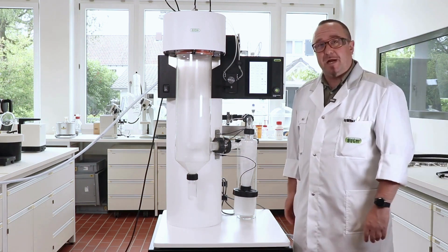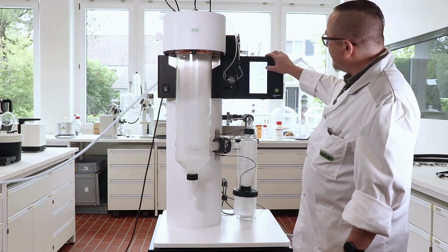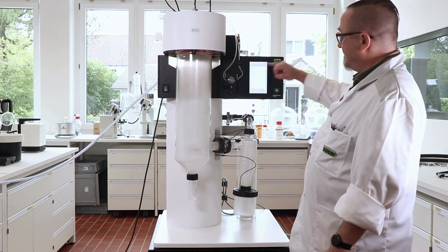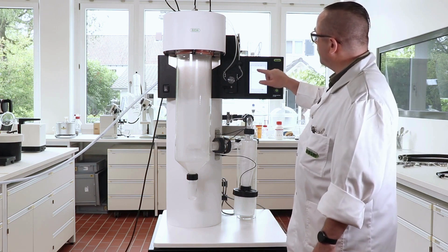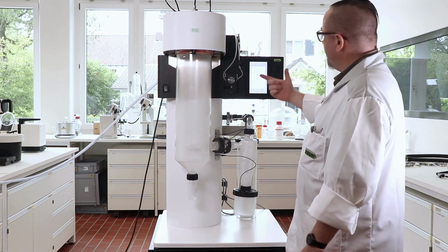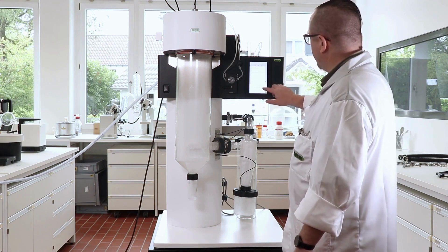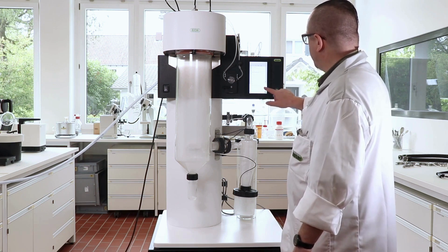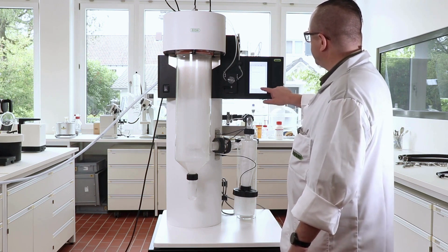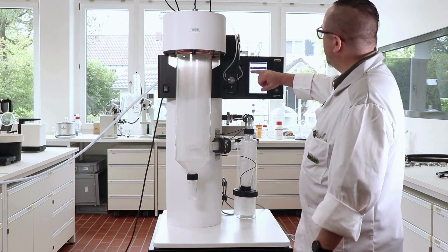As we reached below 80 degrees, we can now stop the device. We press the button at the drying gas and it stops immediately. A new menu opens saying the run is finished — please save your run now. The run name is currently the date and the time. We add some additional comments like 'sample one' and then save it accordingly. Now the run is stored and we can find it in the reports area.